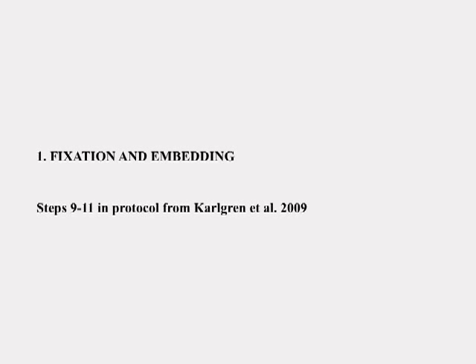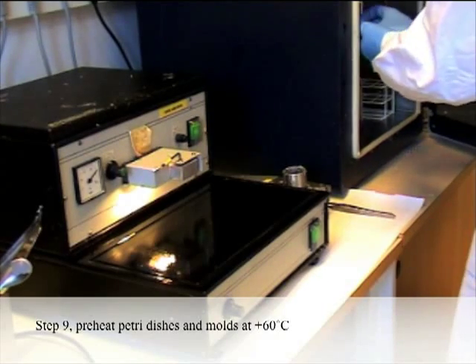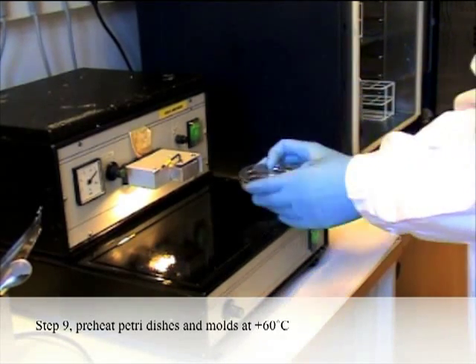1. Fixation and embedding. Steps 9 to 11 in the protocol. Step 9: Pre-heat petri dishes and molds at 60 degrees centigrade.